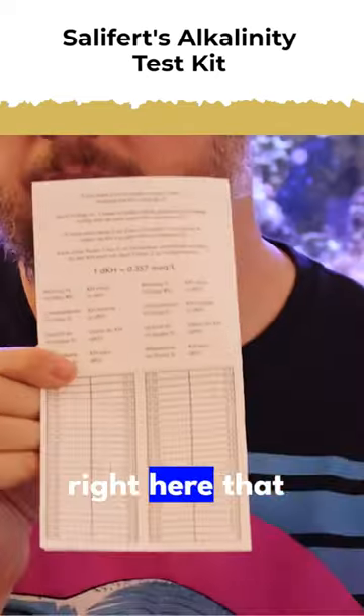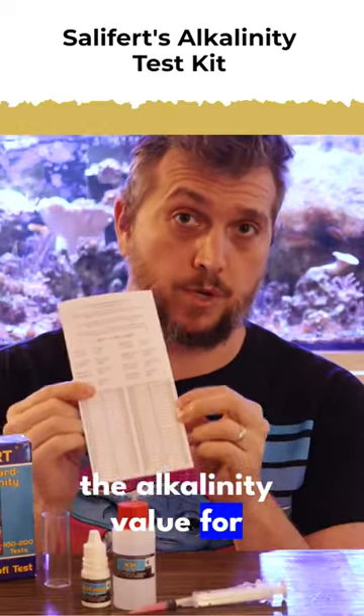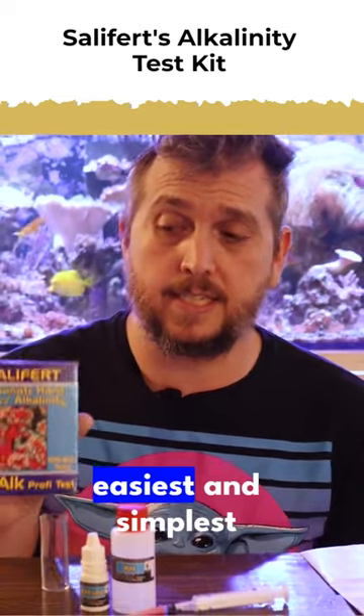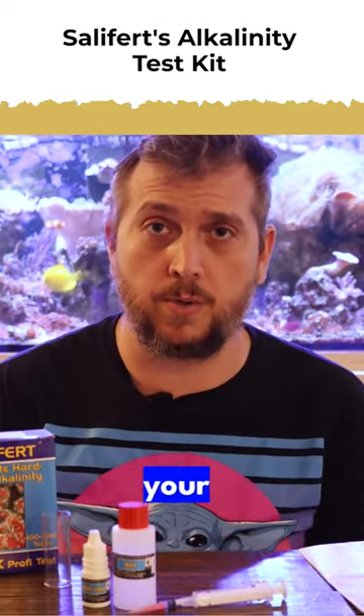they have the chart right here that represents the DKH or the alkalinity value for your reef aquarium. With alkalinity being so important for your reef aquarium, this is probably the easiest and simplest test out of all the tests that you do for your aquarium.